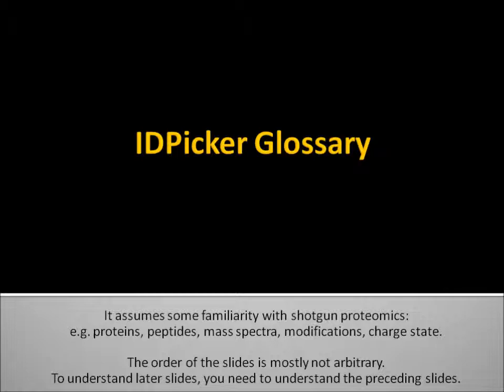That's it. Now you know your basic vocabulary for IDPicker, and knowing is half the battle.